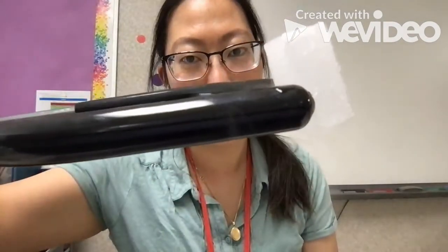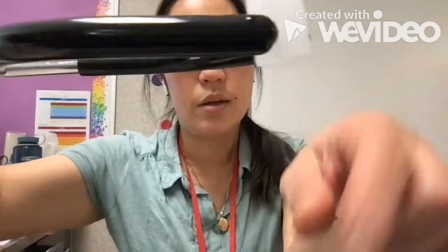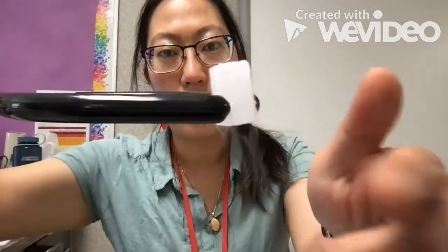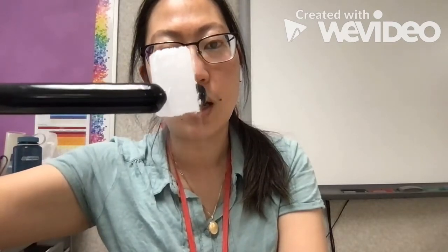Hold it up. You can see it's solid, and there are vapors coming down. And the vapor is cool. That's carbon dioxide gas. And the cloudiness that you see is because water vapor in the air is condensing on the cool carbon dioxide. This is very cold. I would never touch it with my hands. This is minus 78 degrees Celsius. It would cause frostbite if I held on to it too long.